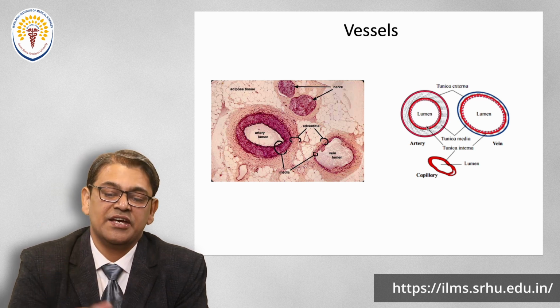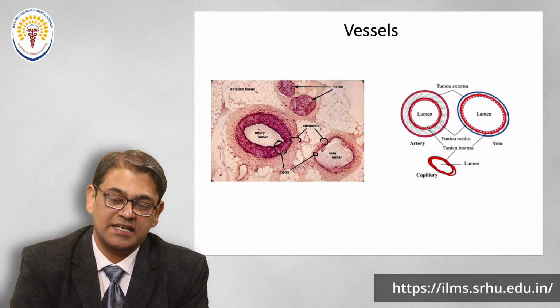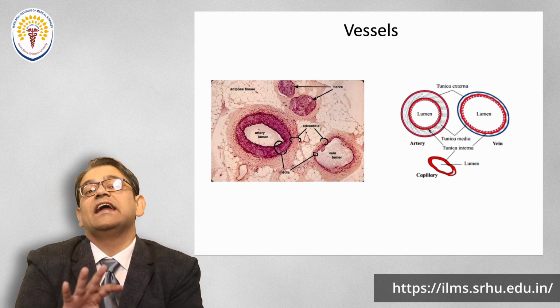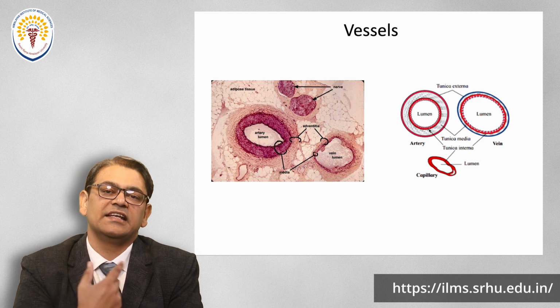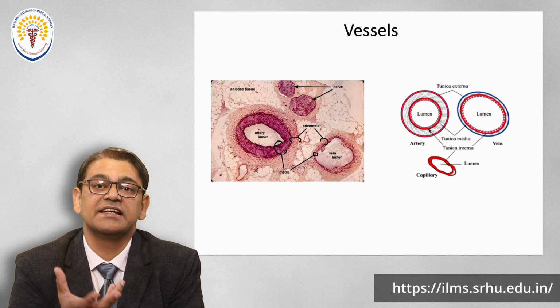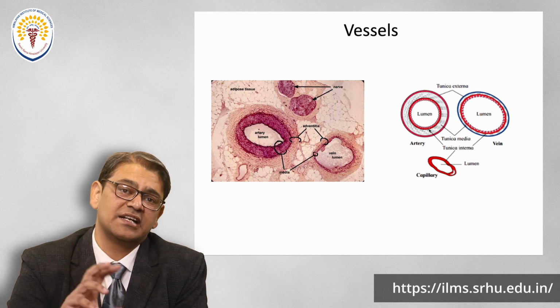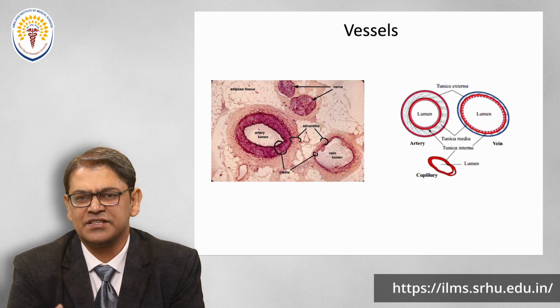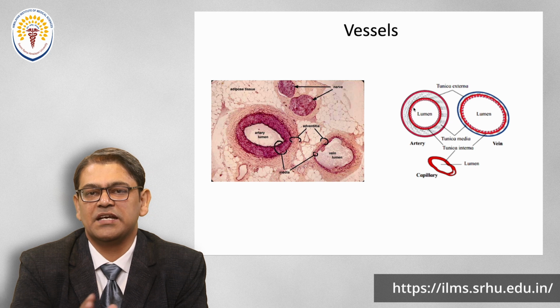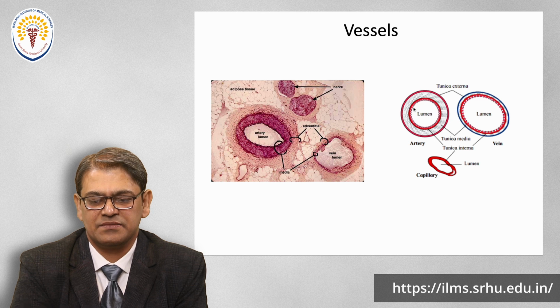If you have seen my earlier videos, you must know about the epithelium and the connective tissue. Yes, the intima is covered with epithelium, and here we call it endothelium, right? Because it is lining the structure from inside, while epithelium lines the structure from outside, so the name gets slightly changed to endothelium, which is actually justified as well. The structure is the same: plain squamous epithelium with a basement membrane, and on that the squamous epithelium is present.